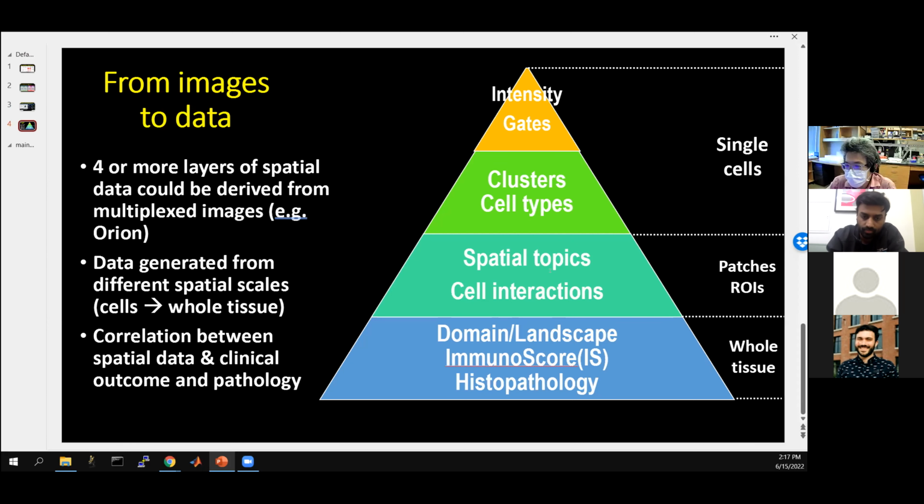But for the spatial omic or spatial proteomic approach, or image-based approach, we can go one step further, or usually we will go one step further, to see if we can find any kind of cell-to-cell communication, right? So cell-cell interaction, as well as some sort of spatial motif, you would say, that would be a building block toward even higher structure. I think that's even less approached. It's like this kind of domain or landscape that's assembled by these small building blocks.